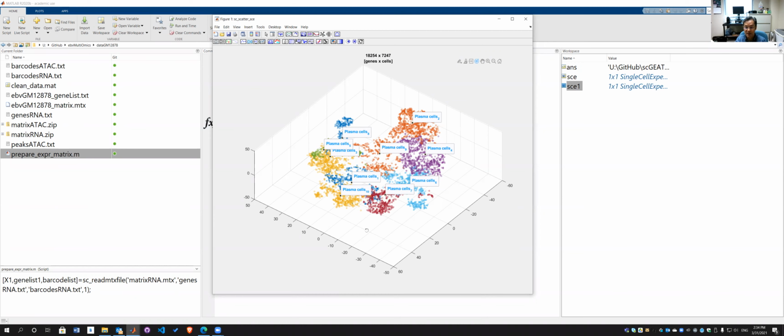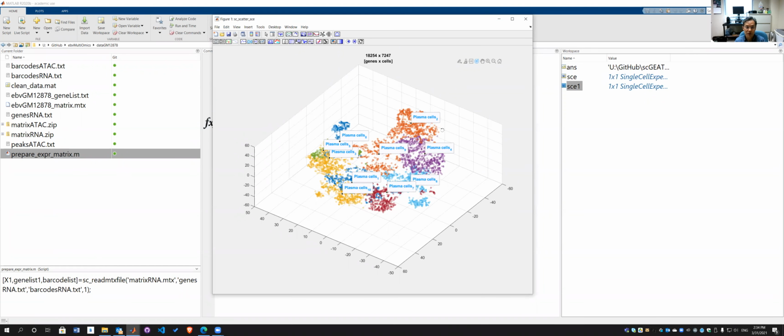Remember, I have a list of the candidate cell types you can choose from. Now I'm going to show you that if you want to make adjustments to the name of the cell types, you should be able to do it. For instance, I want to rename this plasma cell in cluster number 2. There's a button, and I should be able to rename cell types. If you want to label them correctly, you click this button. This button is next to the cell type annotation button.